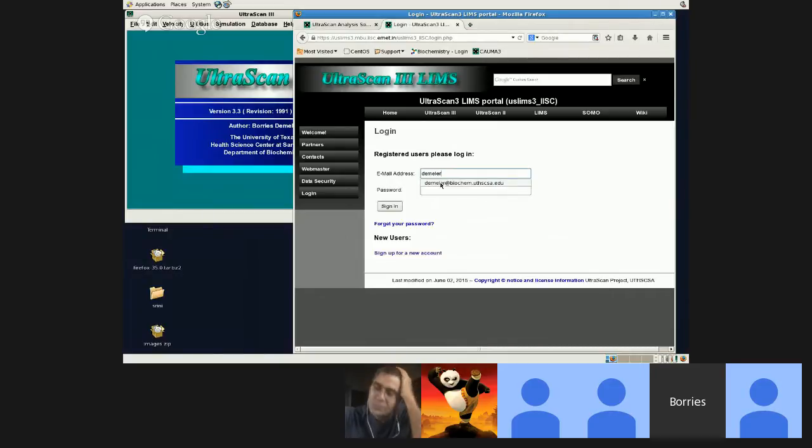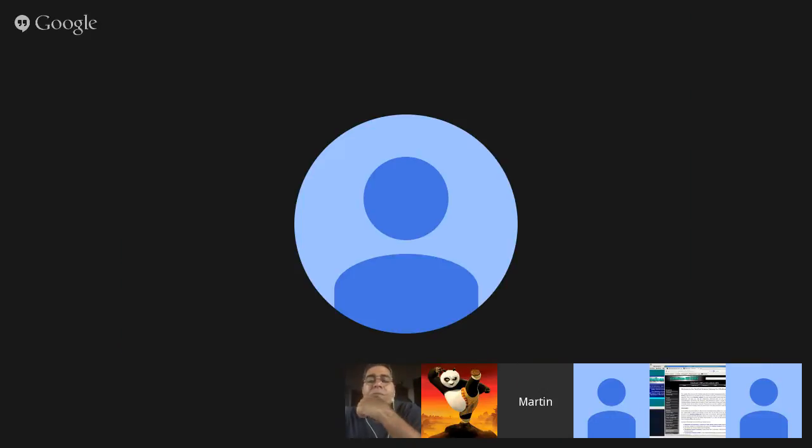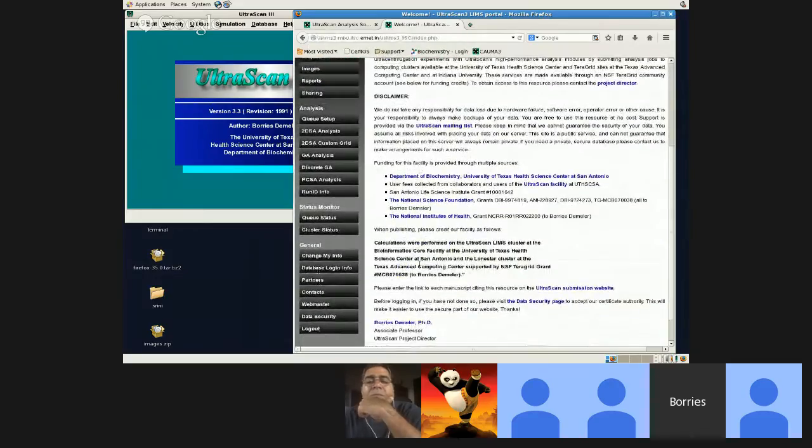And I'm going to log in with my account here. After you sign in, you will see this menu right here. And at the bottom, there will be a database login info. I'm sorry, there will be a change my info button.